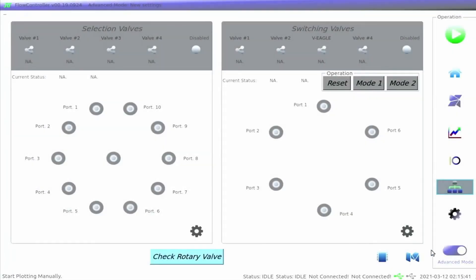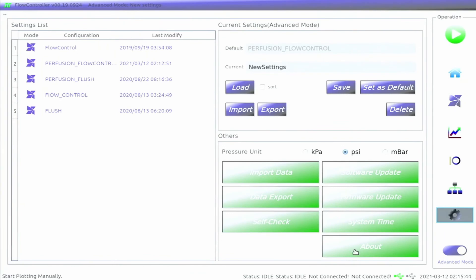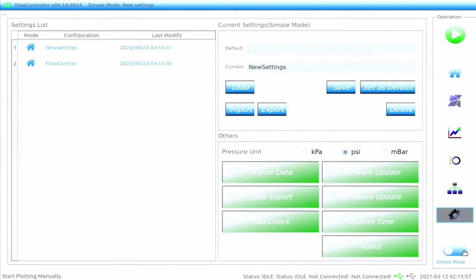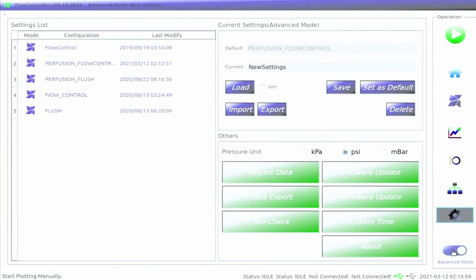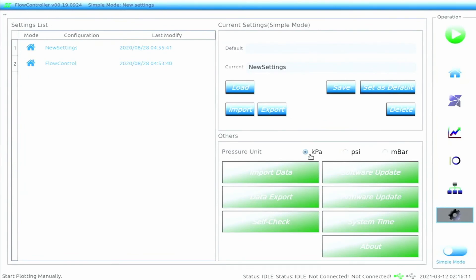Click on the settings icon in the function zone to access the system settings page. Here, users can load, save, import, and export both simple mode and advanced mode data files. By default, simple mode files will be shown on the left. However, if you toggle the advanced mode slider in the bottom right of the screen, advanced mode scripts will be visible. The user can also change the units of pressure.